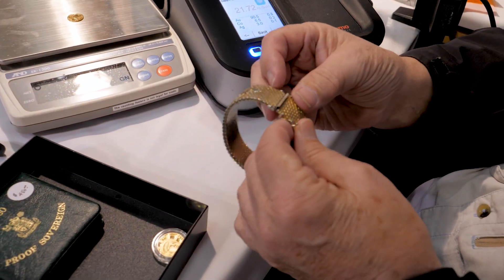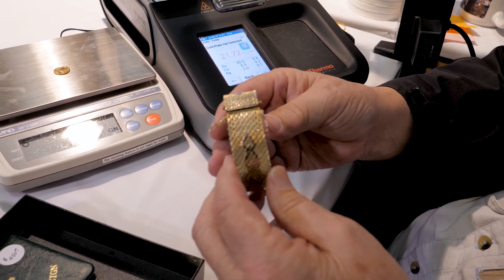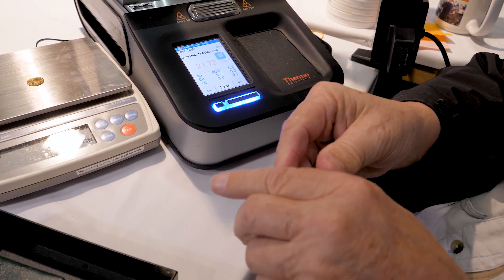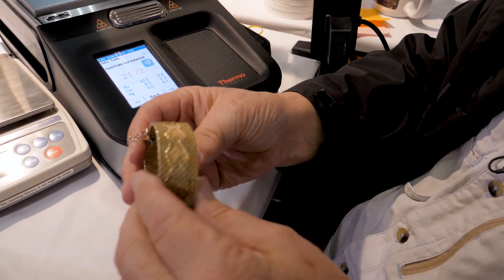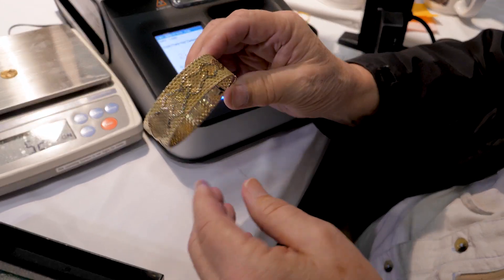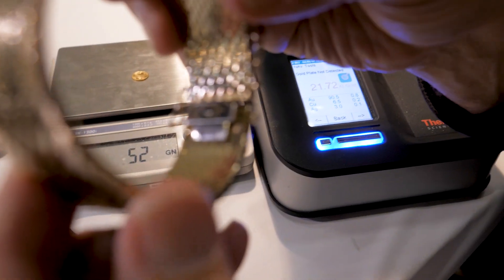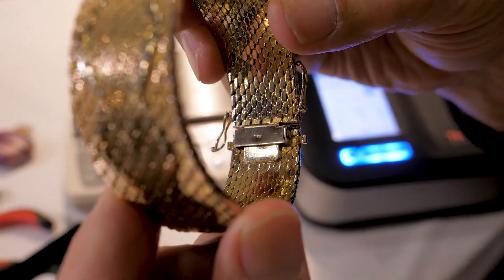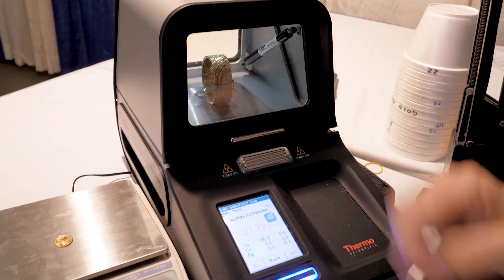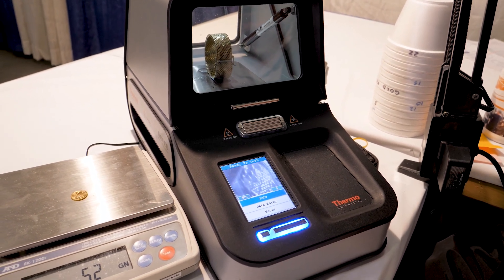Next up, we have a piece of jewelry here that a customer brought in. They bought this as 18 karat gold — it was sold to her as 18 karat gold — and it is stamped in there 18 karat gold. We're going to put it in the machine here and find out, just like we did the coin, what the purity of that 18 karat gold is.